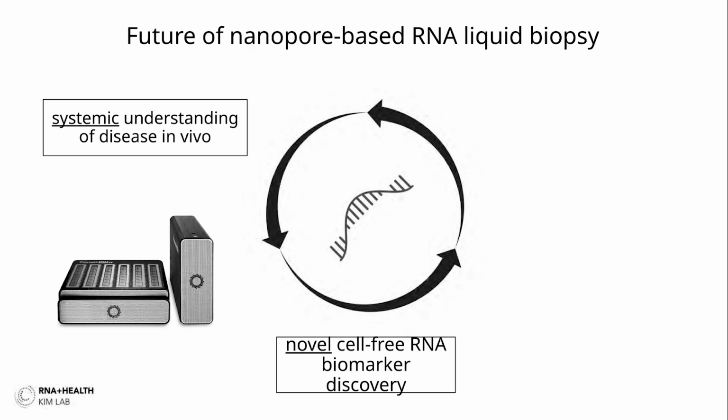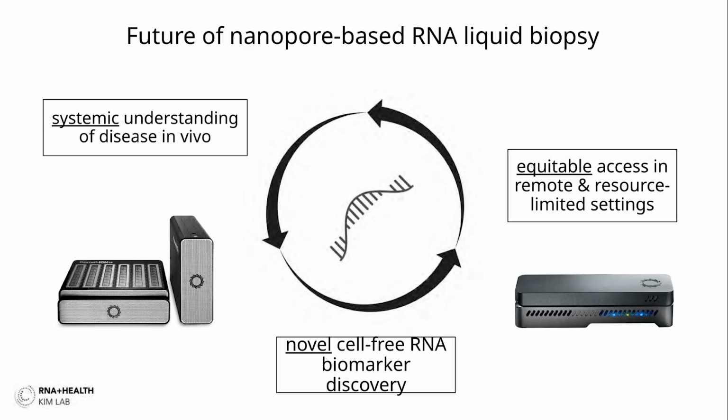And then lastly, we're hoping to develop this for, for example, the MinION platform. I know this is the older version of the MinION, so I should update it. But this is a really handheld approach where we can take this to remote and resource-limited settings with just a handheld sequencer and a laptop. We really want to enable cost-effective, accessible, and equitable diagnostics using this RNA-based liquid biopsy platform. We've been trying this, for example, with the Flongle flow cell, and we're starting to see some promising results there as well.